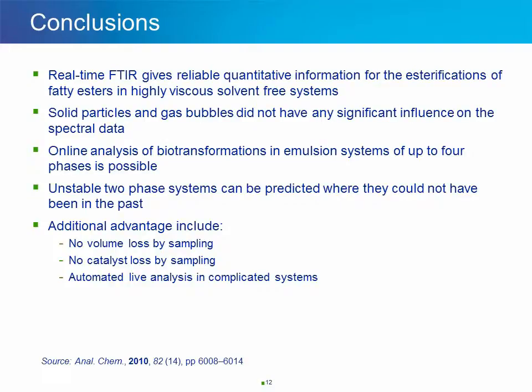And that the additional advantages of applying this technique besides the increased accuracy are as follows: no volume or catalyst loss by sampling, and the possibility of automated live analysis in these very complicated systems.